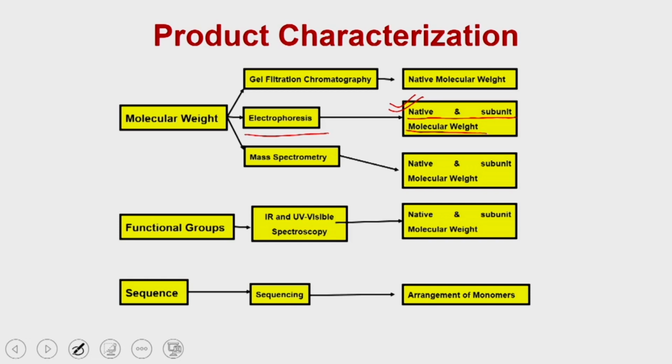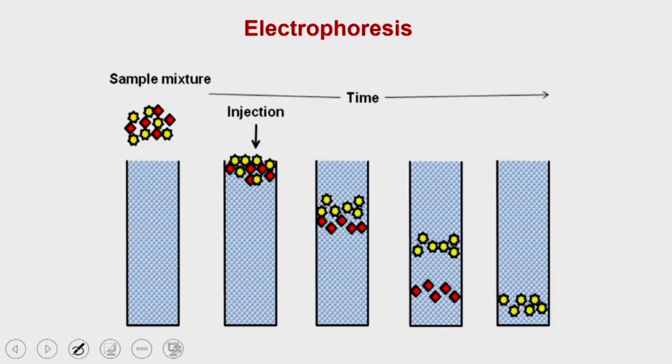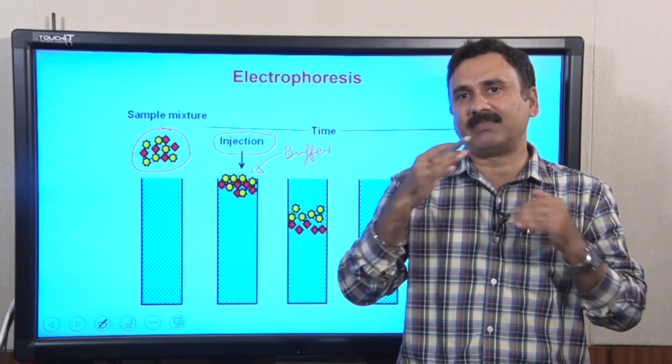So, you can imagine that you are running a chromatography column and you have loaded different types of molecules onto this column. When you inject these molecules, they first run onto the column, and then you flow the buffer, and because of the buffer these molecules start distributing between the different planes or substances, and that is how they get separated.